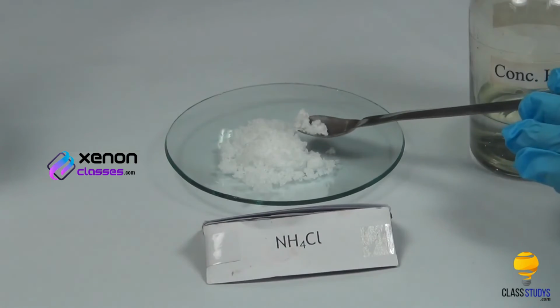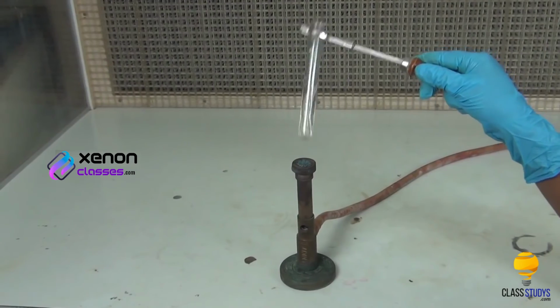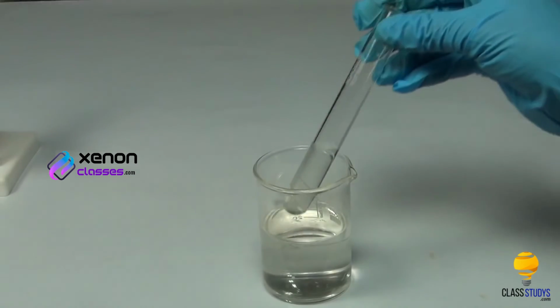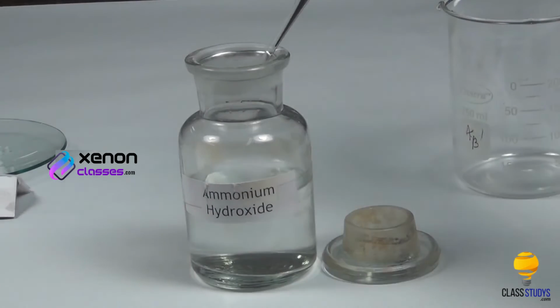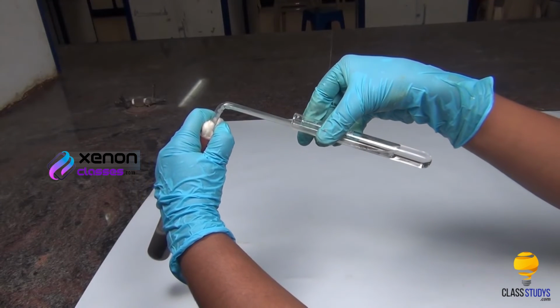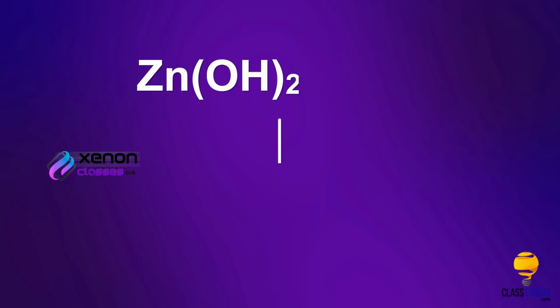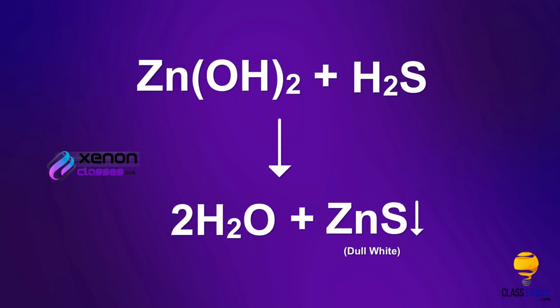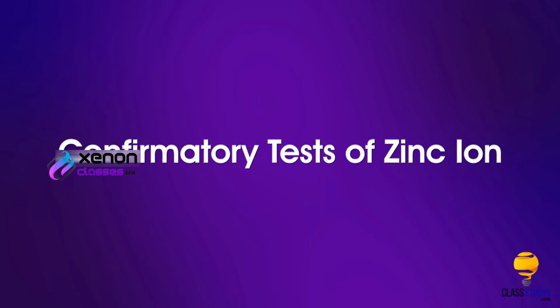Using the spatula, add a small quantity of ammonium chloride to the solution. Boil the contents again and cool the test tube in a beaker containing water. Then, add excess of ammonium hydroxide solution and shake well. Now, pass hydrogen sulfide gas through the solution. Zn2+ ions present in the salt solution react with hydrogen sulfide to form a dull white precipitate of zinc sulfide. Finally, we look at the confirmatory tests of zinc ion.